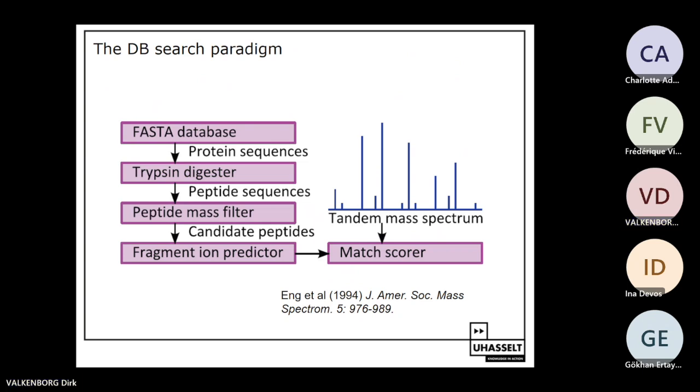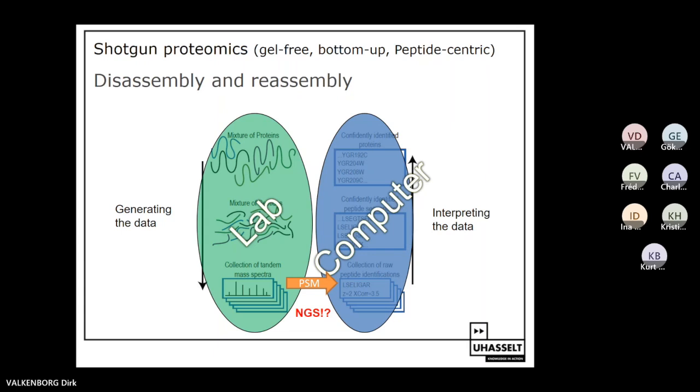Hello, welcome to this third session on a general bottom-up proteomics workflow. In the previous sessions, we talked a little bit about the context, and in this third session, I want to go into more detail on the bioinformatics. Remember that in the lab, when we are trying to identify proteins, these proteins undergo a disassembly process. So we have a mixture of proteins.